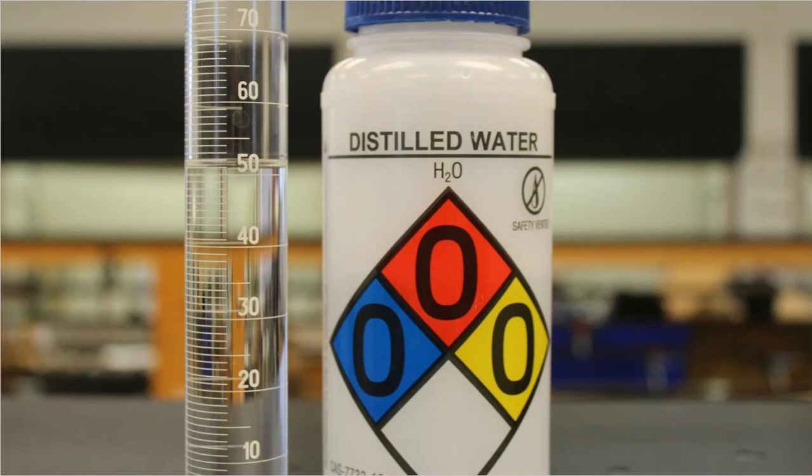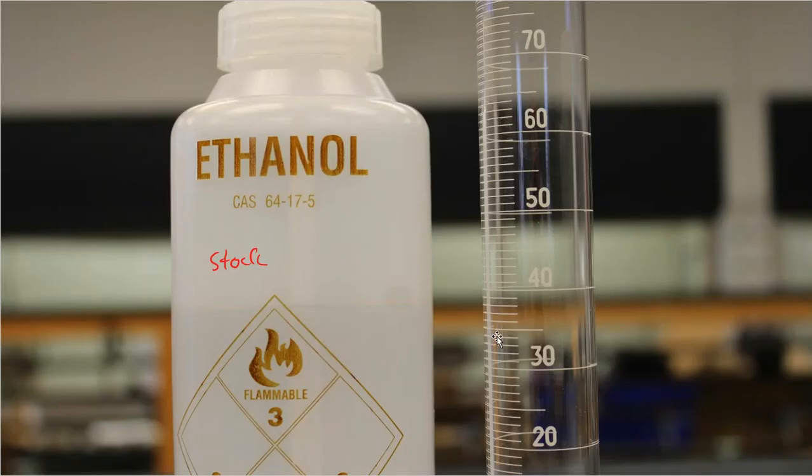All right, so what I decided to do was do 50 mils of each one of these. So 50 mils of water, you can actually see that they are a little bit above 50, but that's okay. And then here's ethanol. I actually snapped this picture before I filled up the graduated cylinder with 50 mils of ethanol, but I used 50 mils of each one, and I gave it a good mix. And this is my recrystallization solvent.